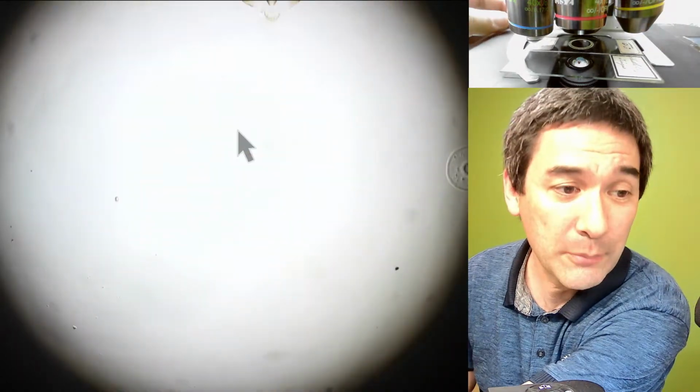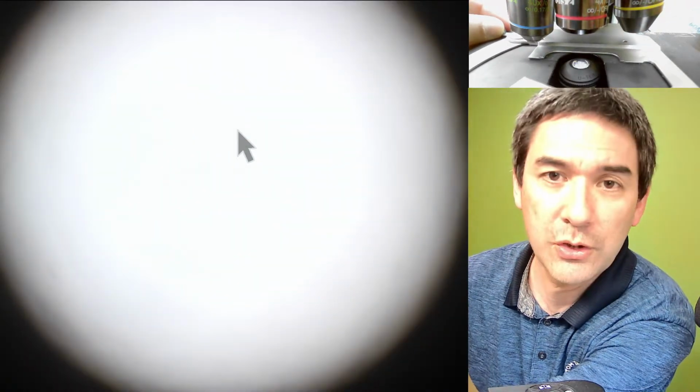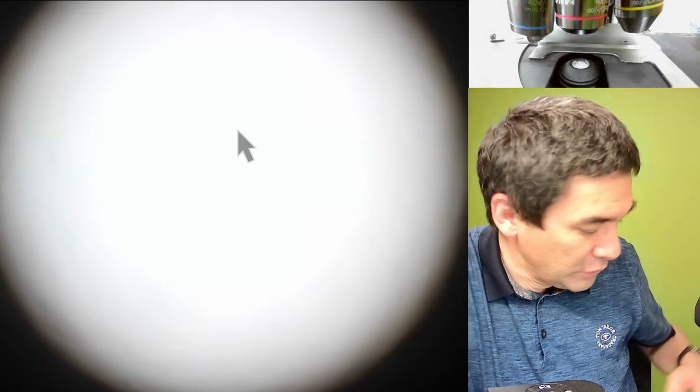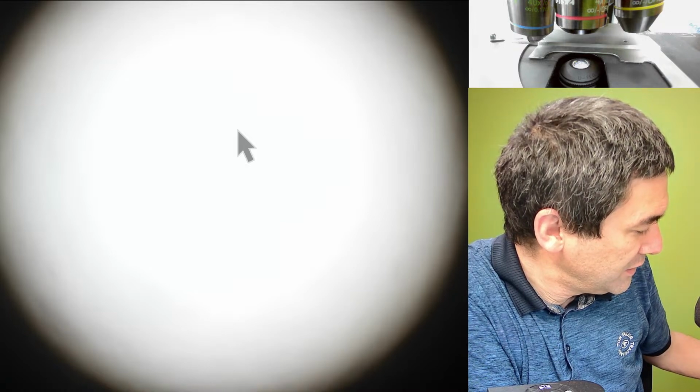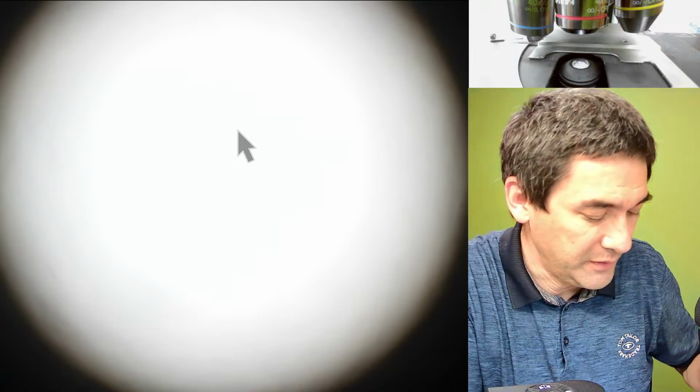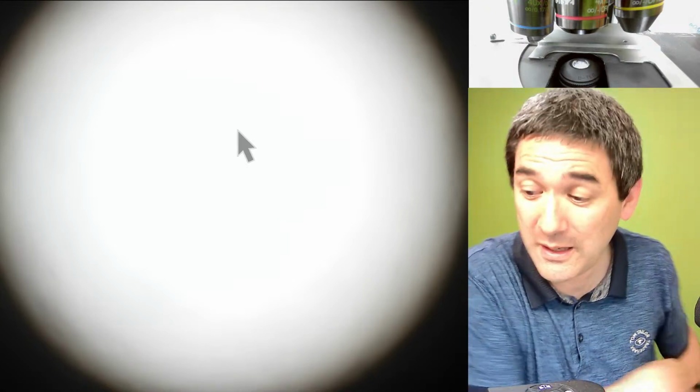So what I'm going to do now is take those out because I'm pushing on, because I do want to show you the thing that I promised you. I have to always make sure that the slides are properly taken care of, because I really cherish them. It's really surprising that those 100-year-old antique microscope slides are actually of a higher quality than some modern ones, because the people at that time spent a lot of time preparing them. They put some pride into it.